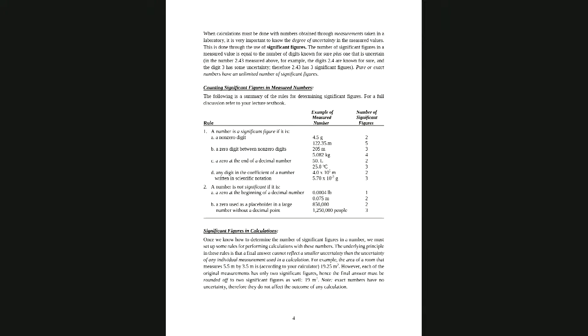The measurements in the lab involve significant figures. When you are measuring a quantity using a measuring device, you are going to report the number based on the accuracy of your measuring device, which is going to have all certain digits, with the exception of one digit that is uncertain or estimated. When you report the number with that property, your reported number is said to be significant, or you are reporting the number with proper significant figures.